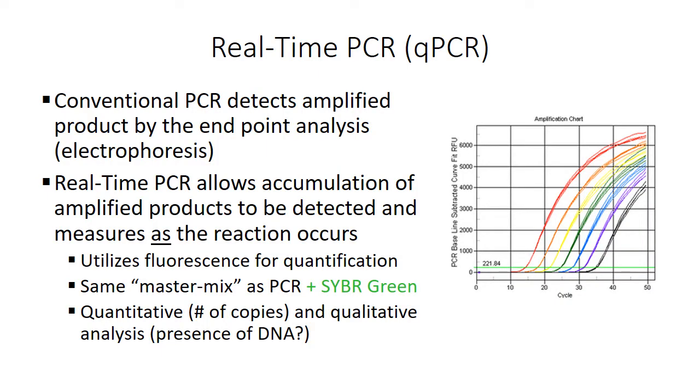All right, so let's talk about real-time PCR. I know you guys are familiar with traditional PCR, polymerase chain reaction, and to provide a quick overview of PCR, in our previous labs, we discussed the fact that if you have a DNA sample and you want to amplify it or increase its quantity, what you can do is you can set up a PCR reaction using a thermocycler. And when you do a PCR reaction, it basically amplifies the amount of DNA that you have. And at the end of completing your reaction, you now have not only a lot more DNA, but you're also able to visualize that DNA by doing electrophoresis and looking for specific DNA fragments.